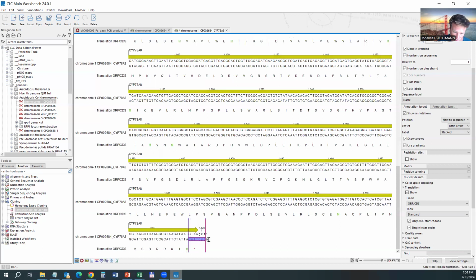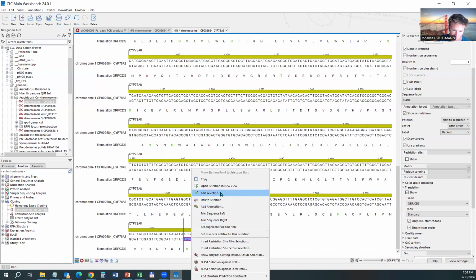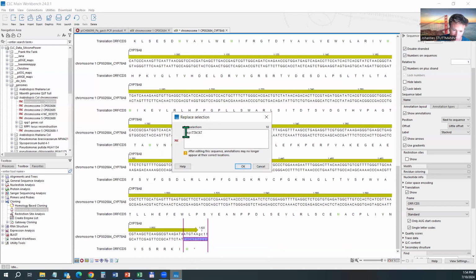So if I select this here and not the top strand, then I will add on the bottom strand in 5' 3' direction. So this actually means that as soon as I click edit selection here, this is the 5' end, so this part on my sequence. So I now have to add TT. I said always these two useless nucleotides, let's say, GG, TC, TC, and now I put an A for fun.